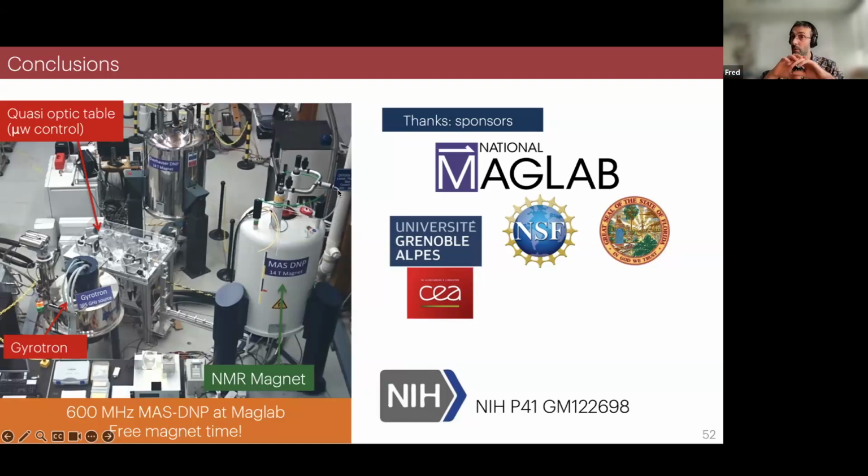As a consequence, even if you have many protons around your molecule, then you have many pathways for this polarization to get out. And so you can really hyperpolarize easily what's outside. So the cross effect becomes a vastly dominant mechanism for feeding the hyperpolarization and not the spin diffusion. Large proton concentration will then mean more cross effect locally and more overall polarization that can be given to the rest of the sample. Of course, there's a drawback.